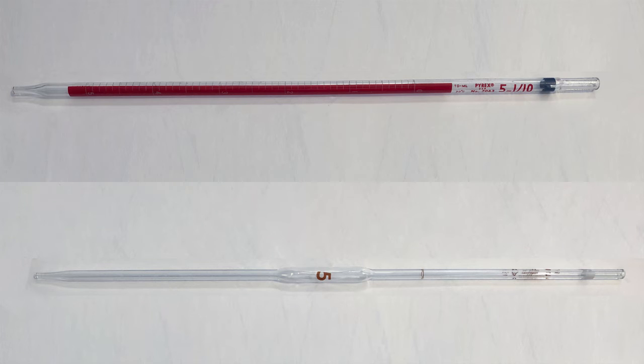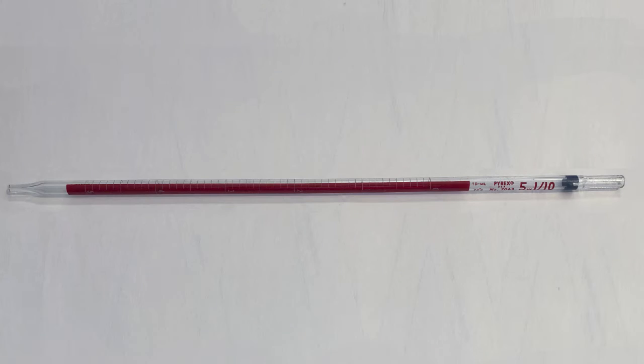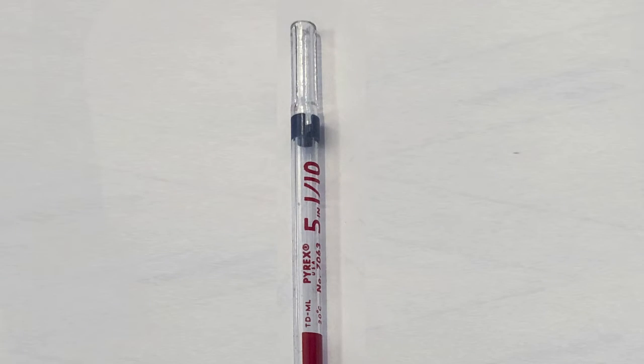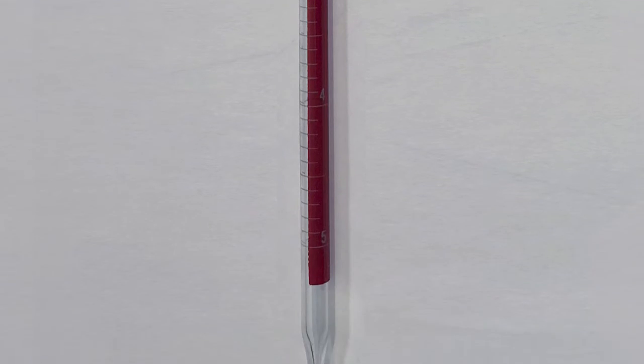Pipettes are generally more accurate, but also require more skill. A measuring or graduated pipette has markings, much like a burette. And like a burette, you can transfer all or part of the liquid.